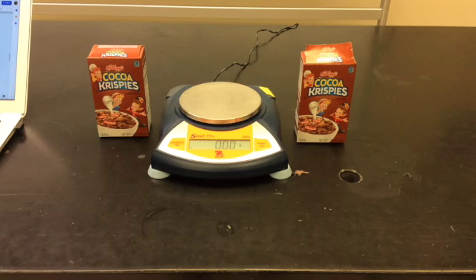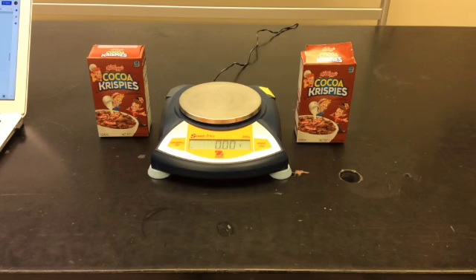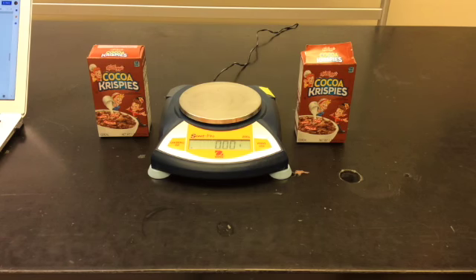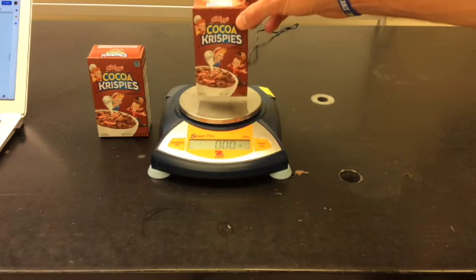Alright guys, this is Procedure Part 1, Truth in Labeling. We're going to take the mass of the empty cereal box.